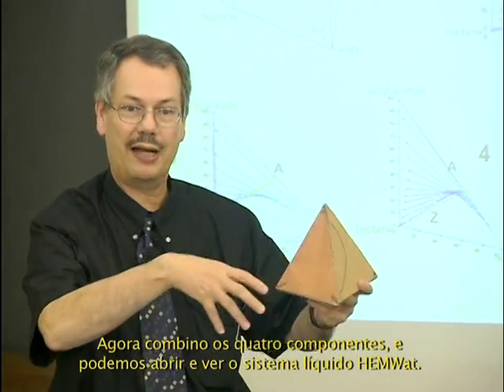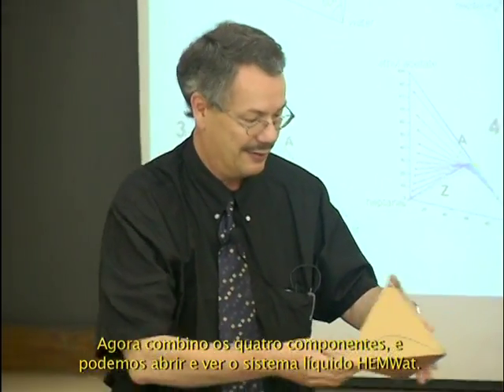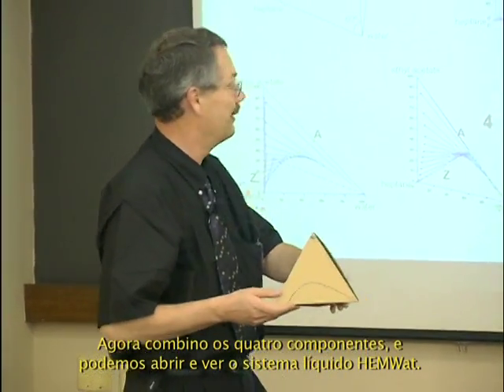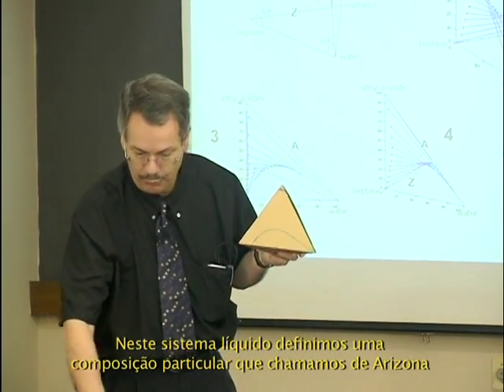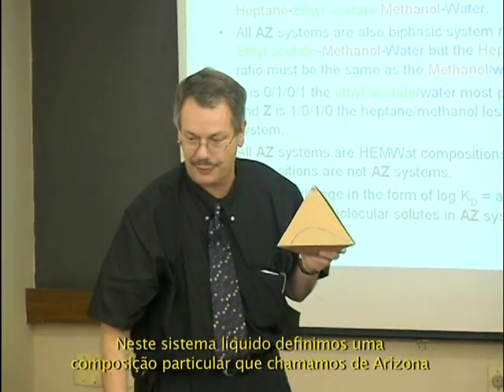Okay, and now I combine those 4 compounds, and you can open it, and you have the HEMWAT liquid system. In this liquid system, we defined a particular composition which is called Arizona.